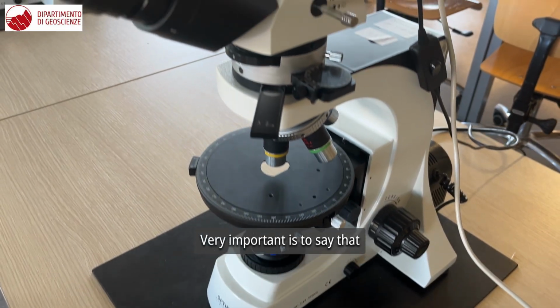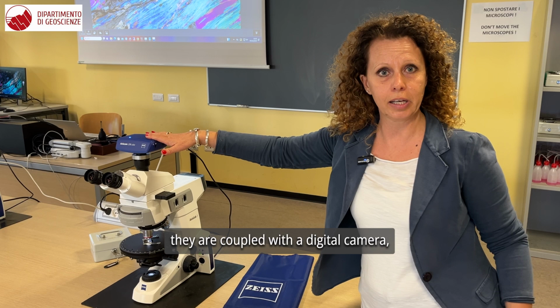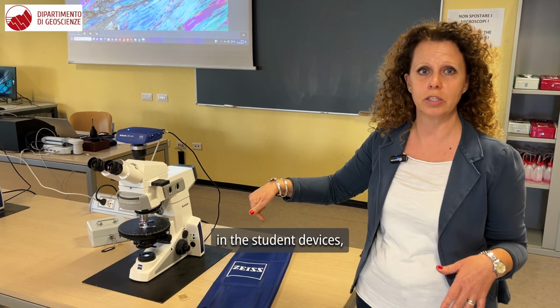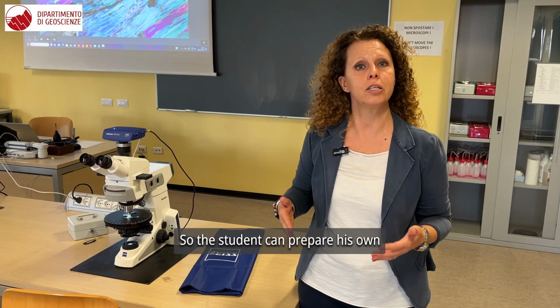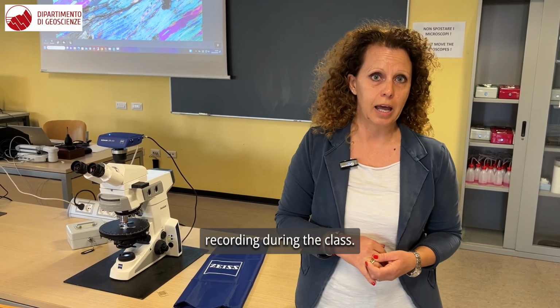Very important is to say that the microscopes we have are coupled with a digital camera, which allows the student to take his own images, which can be downloaded on the student's devices like smartphone, tablet, or PC. So the student can prepare his own notebook with the images and videos recorded during the class.